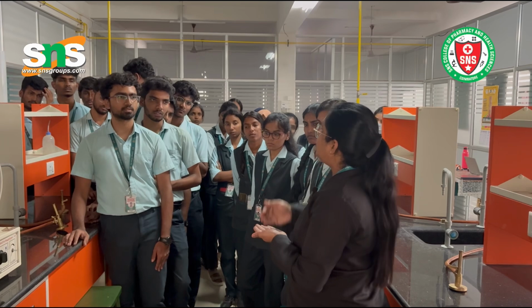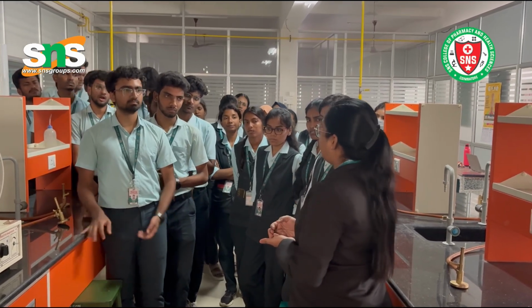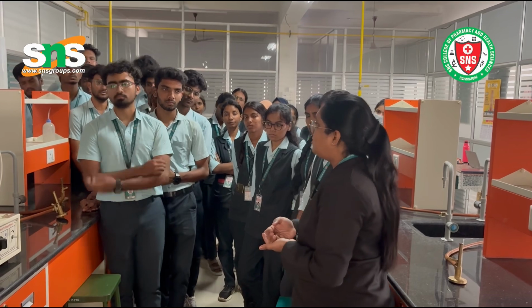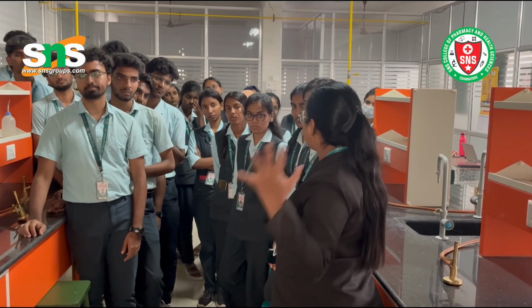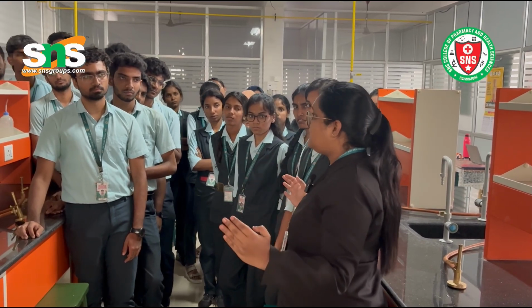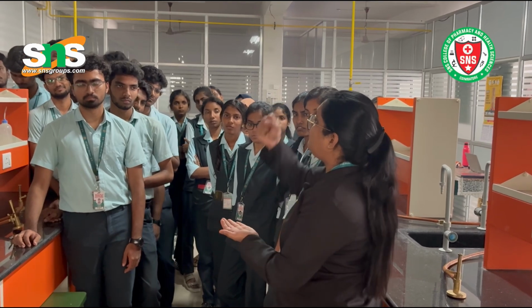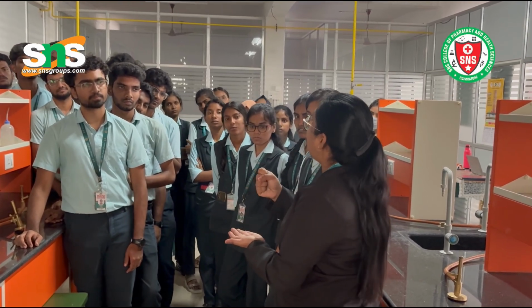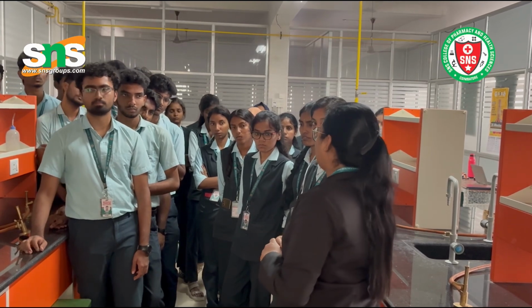Because from the industry it reaches the market in bulk logistics, and we pack the tablets. During that packaging and during the transportation, any breakage that happens, or how much weight can be kept on the package, this friability test apparatus will decide.